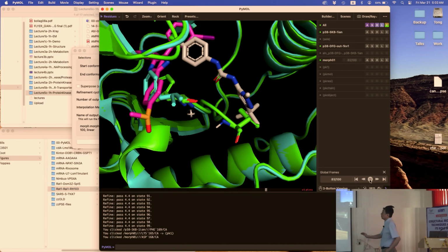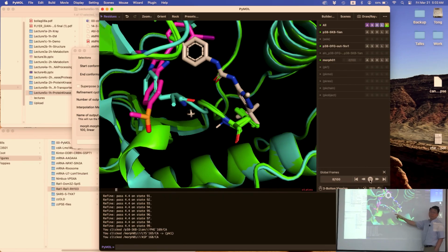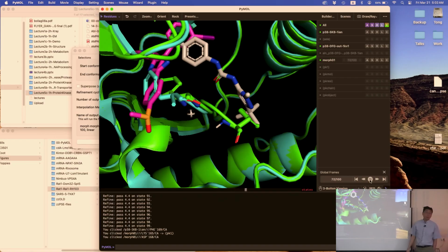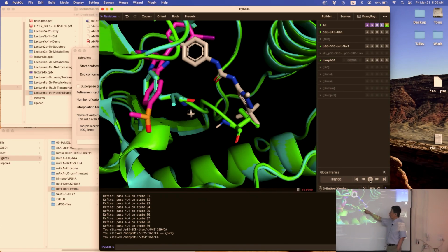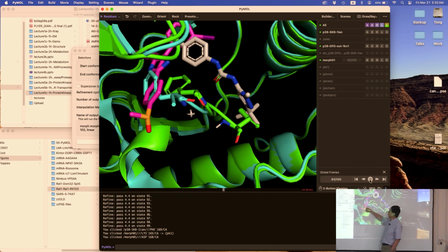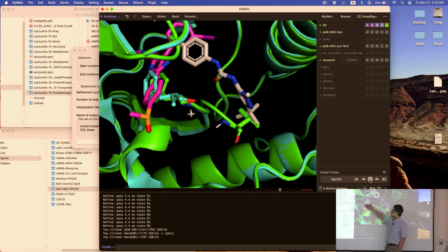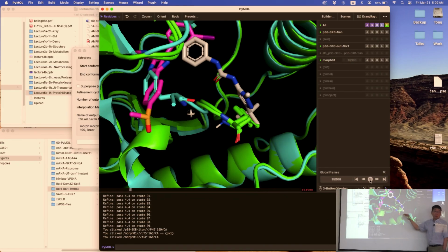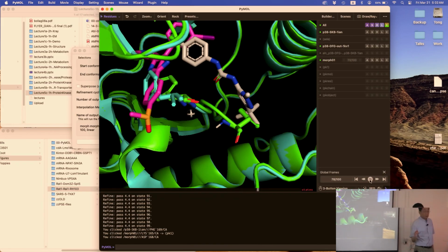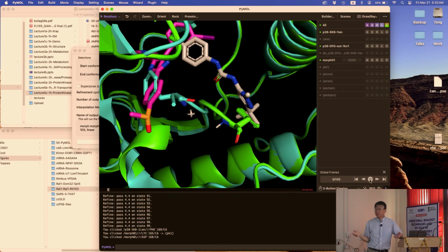so you see the phenylalanine side chain move as well, right? So in here it is clashing against this compound. Over there it is clashing against the compound, or where ATP is. So ATP binding is not possible. Over here, the compound binding is not possible. Do you see something similar?